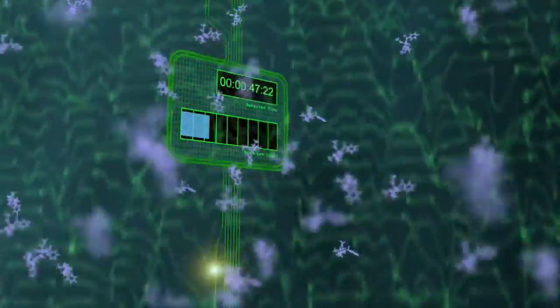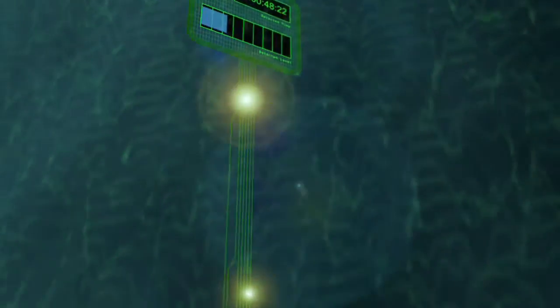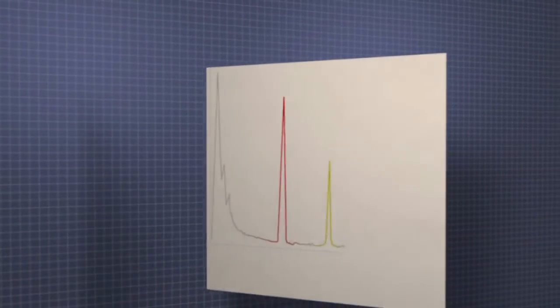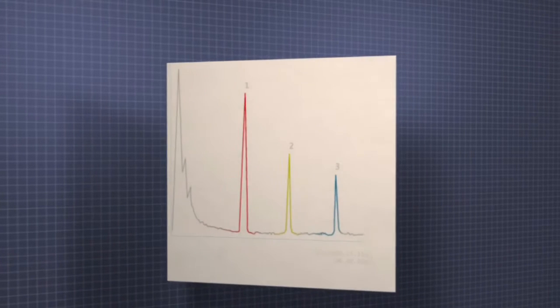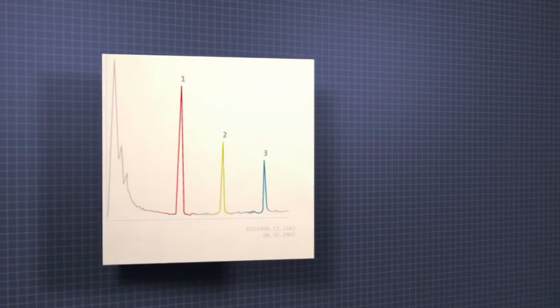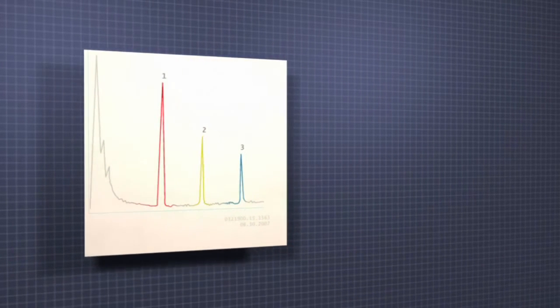The detector sends an electronic signal to an amplifier, which prints a chromatogram representing the exit time and amount of each compound with a series of peaks.